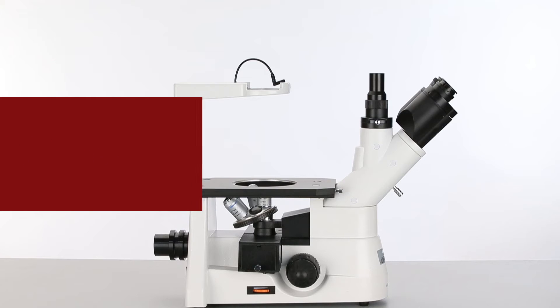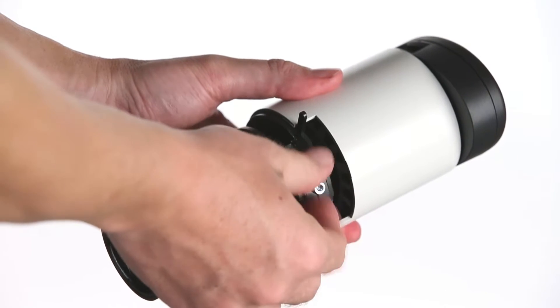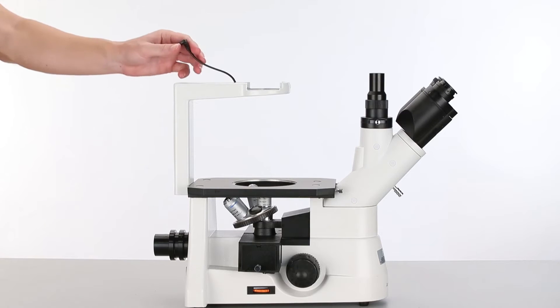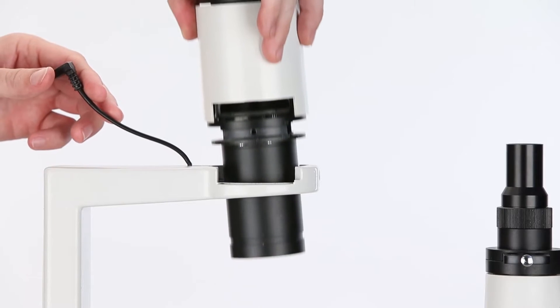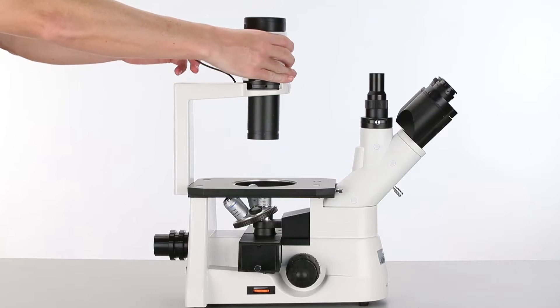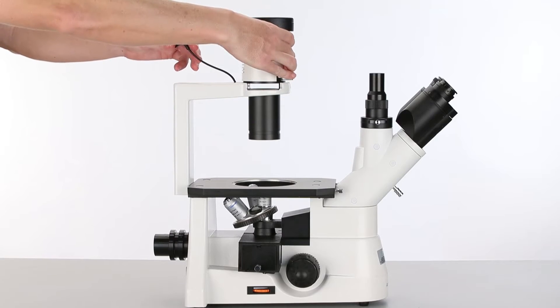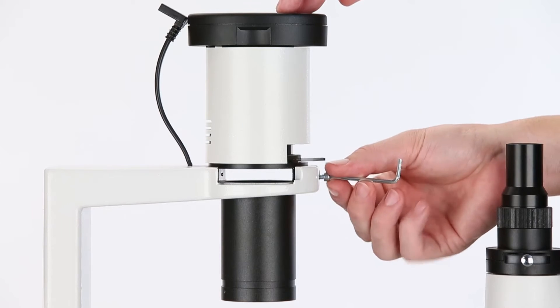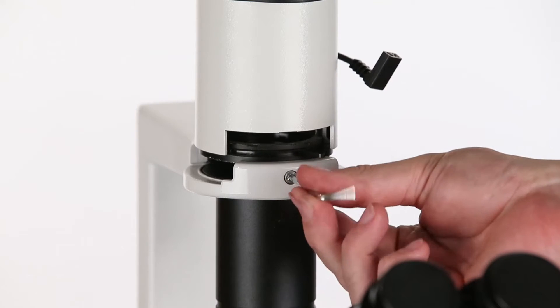Before installing the top lighting module, remove the locking screw from the front. To insert this lighting module, it must be inserted into the collar with the threaded hole facing the side of the microscope. Then rotate the module 90 degrees so that the threaded hole faces the front of the microscope — it will line up with a hole in the collar. Then insert the locking screw and screw it in to secure the lighting module.